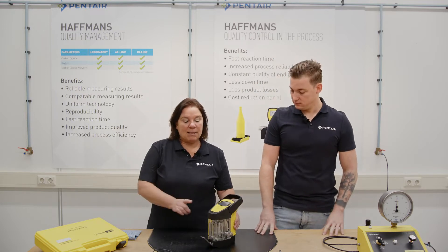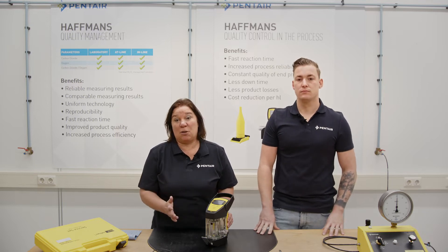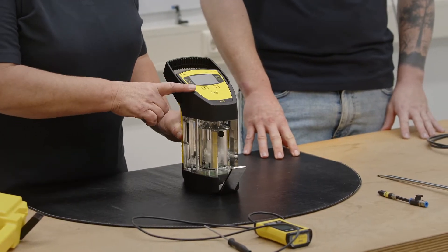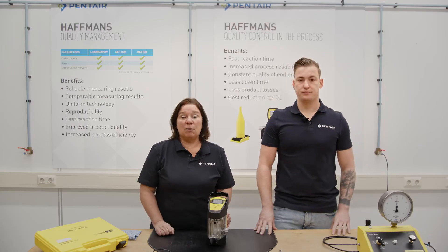The gehalte meter measures CO2 content in a carbonated product like beer, soft drinks and mixtures. Based on Henry's law we measure the temperature and the pressure and with the CO2 formula integrated in the meter, the CO2 value is measured.